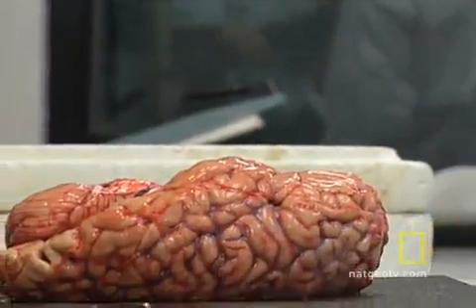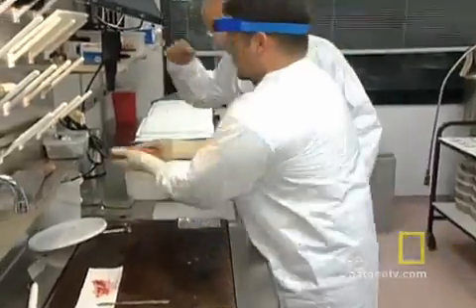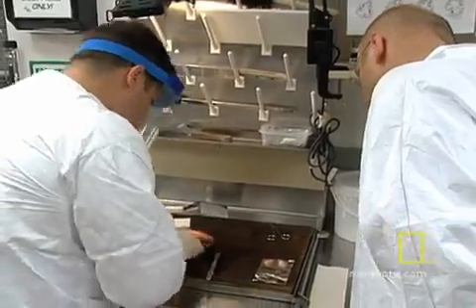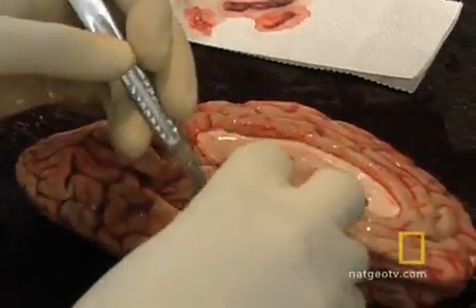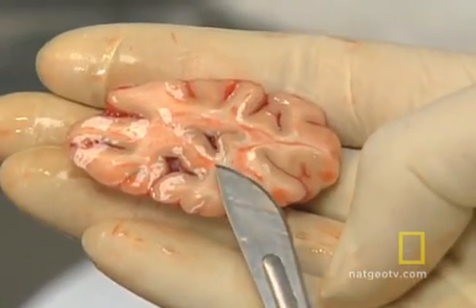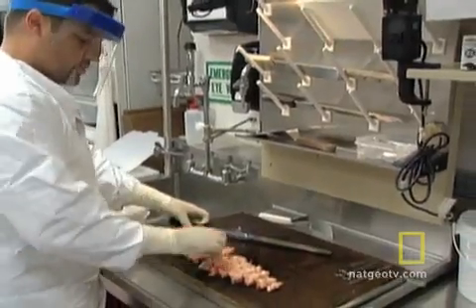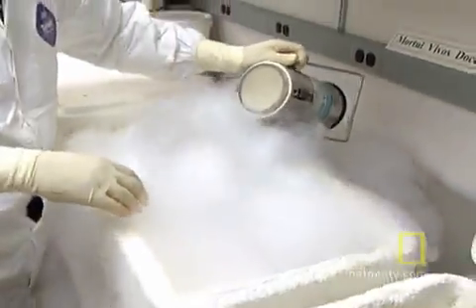I'm going to go ahead and bisect the hemispheres now. First, Luis separates left brain from right, preserves one half in formalin for later anatomical studies, then moves on to the other half. He removes all the critical parts, brainstem, hippocampus, amygdala, and precisely sections off the rest of it. This is just cortex here. I see. Just cortex. That's all. The brain lab looks eerily like a kitchen, but it's not the spectacle one might expect. Finally, Luis freezes away all the samples to keep the proteins and DNA fresh for genetic analysis.